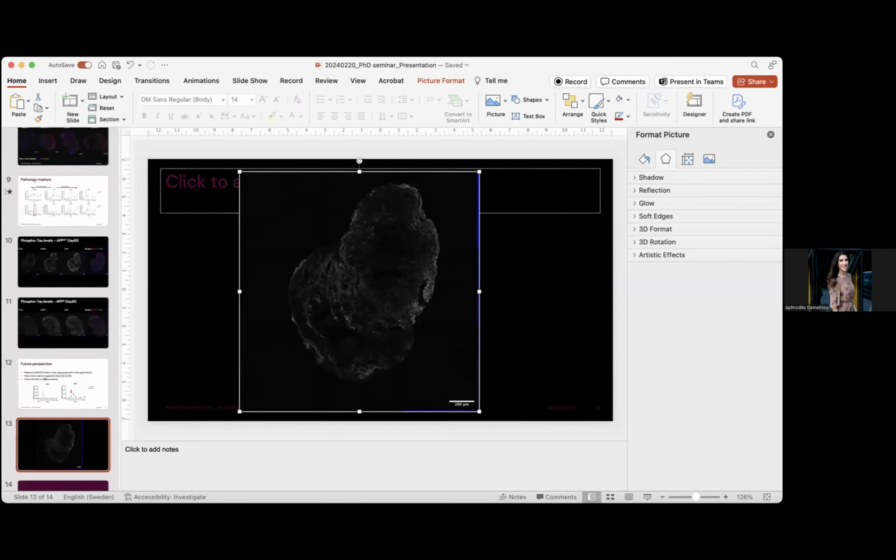You do all this in which software? In ImageJ. So here you can clearly see this blue line, and it's created in all the images. All your images, yeah. Why is this happening? I'm not sure. These are acquired in NIS-Elements, right? Yes. So somehow there must be like 1 or 2 pixels. The image is a couple of pixels bigger than what is acquired.